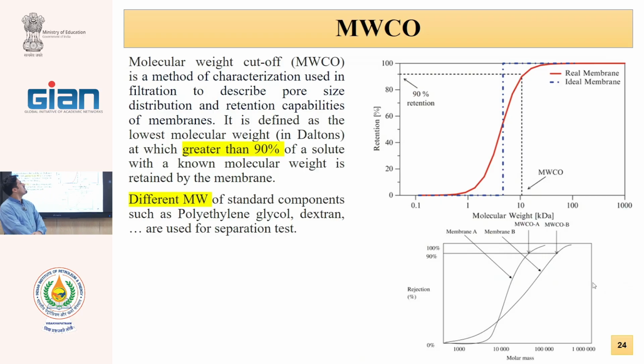One of the important parameters in filtration membranes, MF, UF, and NF, is molecular weight cutoff.